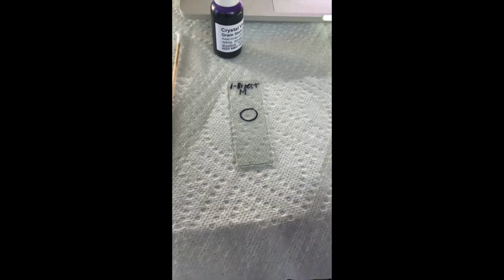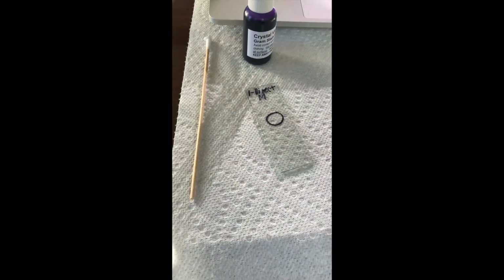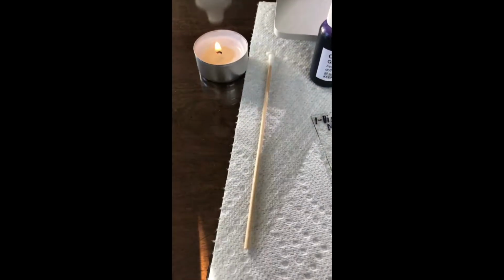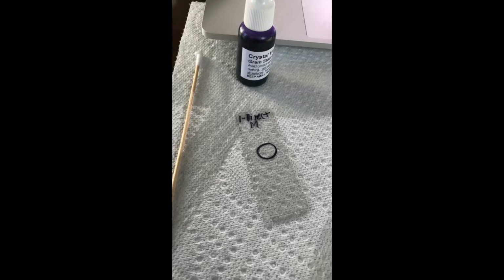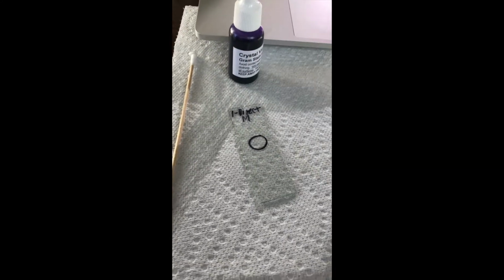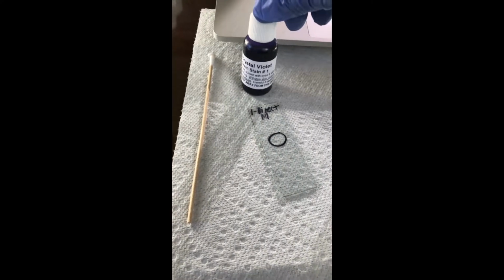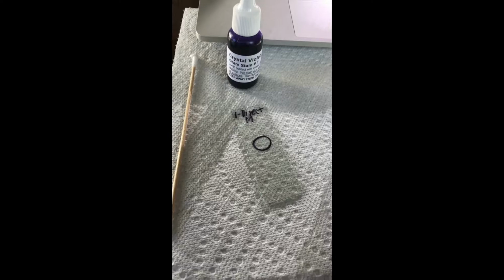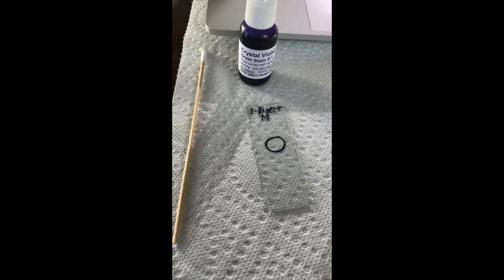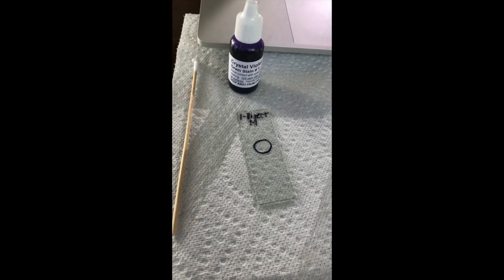So right now I'm just letting the smear cool after passing it through the flame for 5 seconds to allow the bacteria to adhere to the slide. And then after 10 minutes, I'm going to apply this crystal violet stain, which is going to sit for 60 seconds. And then we're going to rinse it and then apply the next set of stains.